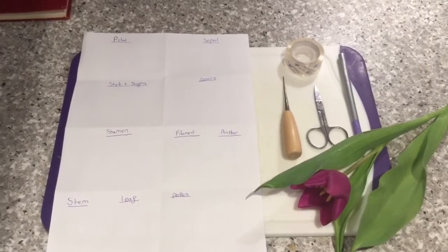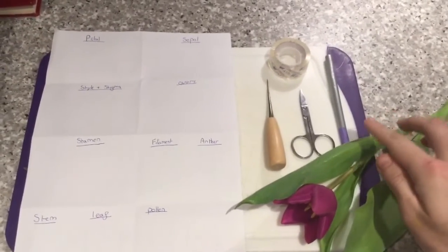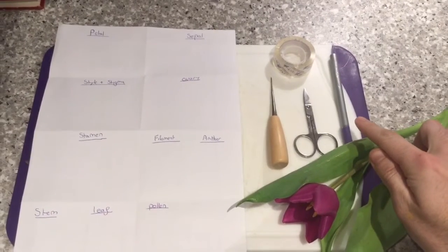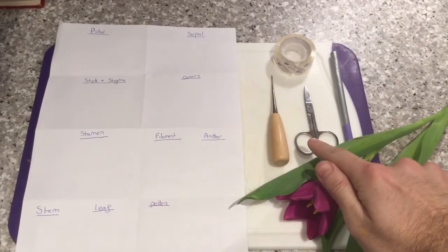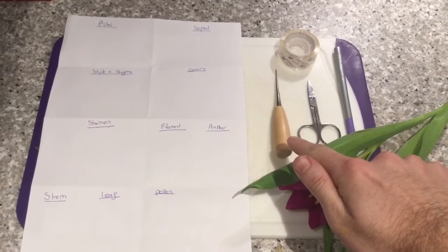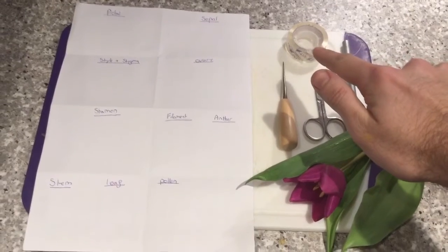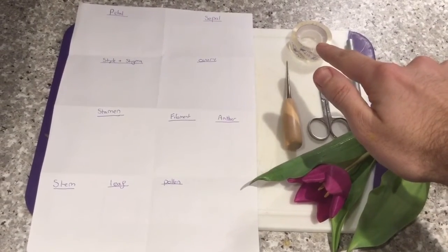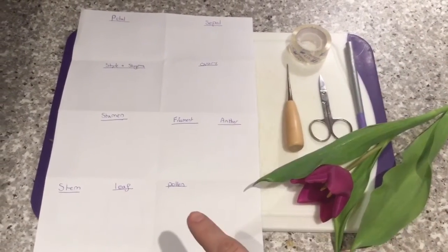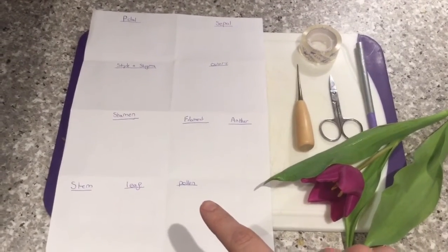The first thing you need to do is collect all of the equipment you're going to need for this practical. One of the things we're going to need is a pen, a pair of scissors, either a pair of tweezers or a needle so you can manipulate the things you've got, some sellotape so we can stick all the pieces we've cut out onto the paper, and we need some paper with all of the pieces of flower labelled on there.